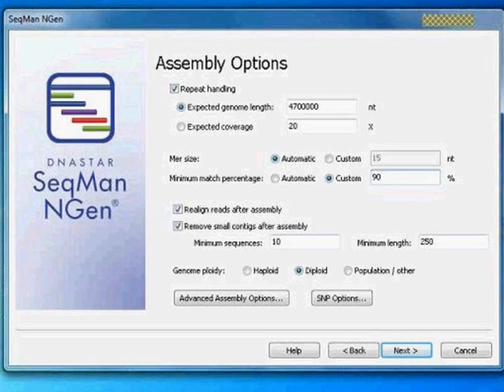Downstream, if you get too far along your annotation work and gap closure and find that you have errors in the contigs, that creates a lot more headache and a lot more work for you. So I often recommend to try a couple different stringencies, all the way up to 95 down to 85, and evaluate some of your contigs to see what quality is best and then proceed from that point. We can also remove the smallest contigs from the assembly. Usually we don't try to scaffold the really small contigs, and certain data types like Illumina can yield many very small contigs. We can call those out.